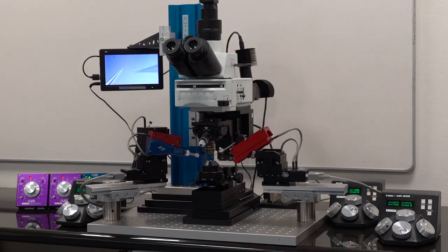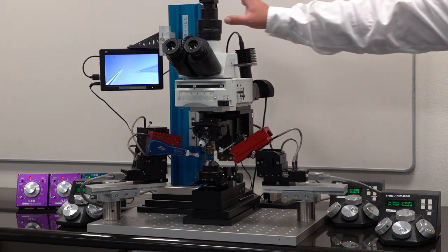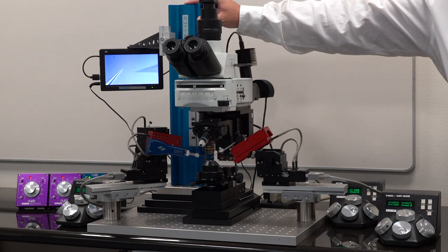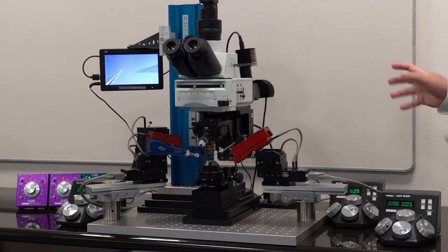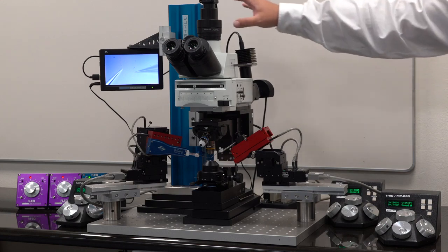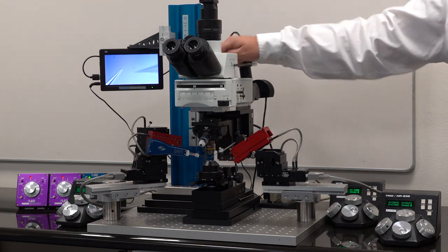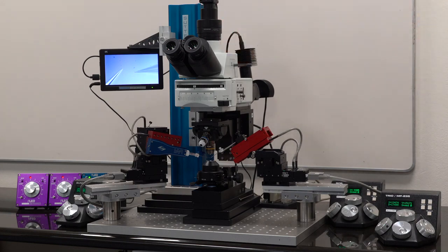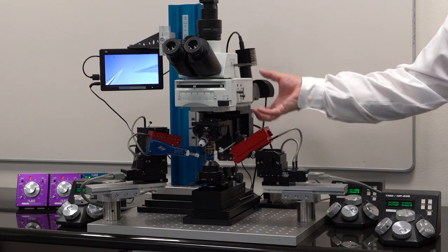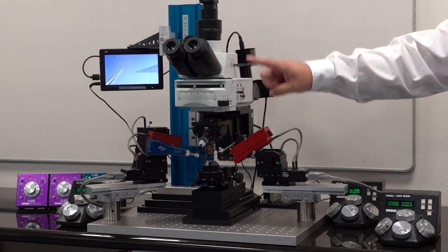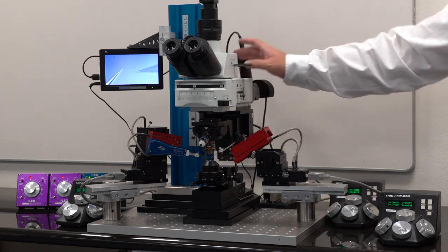Now I'd like to talk about the Bob system. Now the Bob is different from most electrophysiology scopes that you've seen before. And you'll notice the microscope frame has been replaced with a blue optical rail that you see here. And the entire Bob system is connected to this blue optical rail with a single connection point. And the point of that is easy height adjustment. All you have to do is loosen those two screws and bring the microscope up or down. This entire core mounts with that single point.